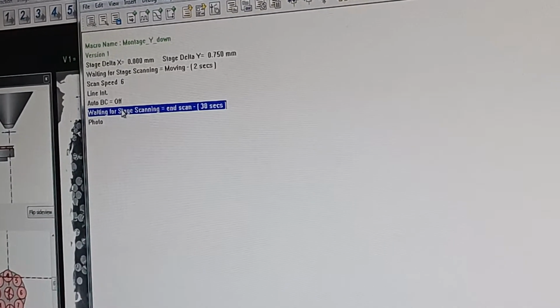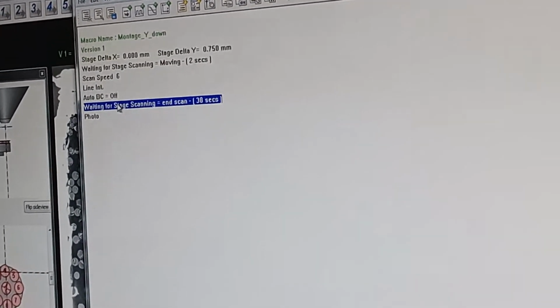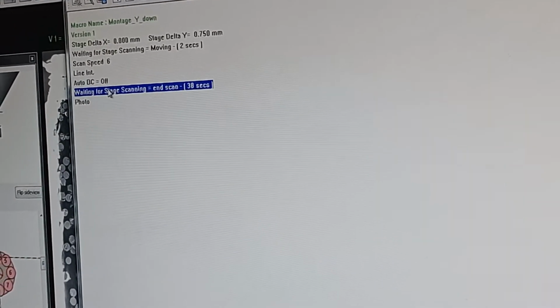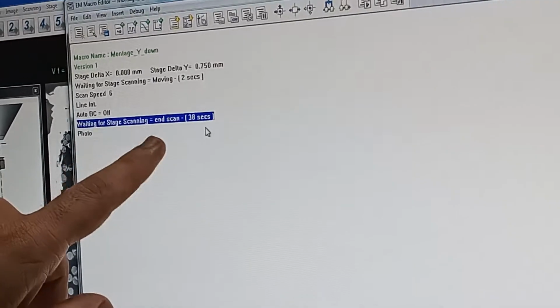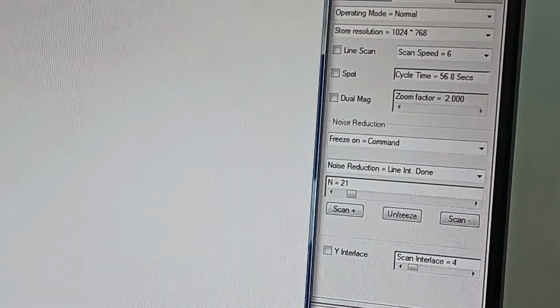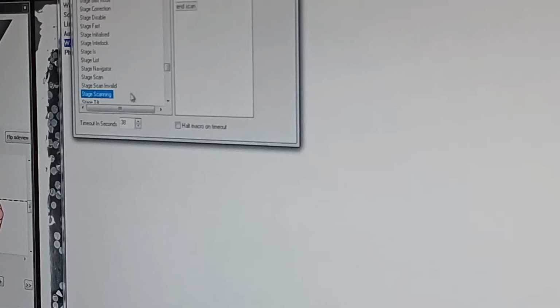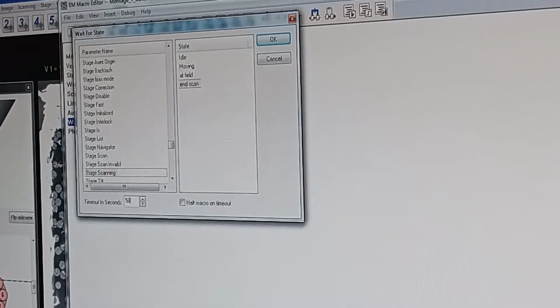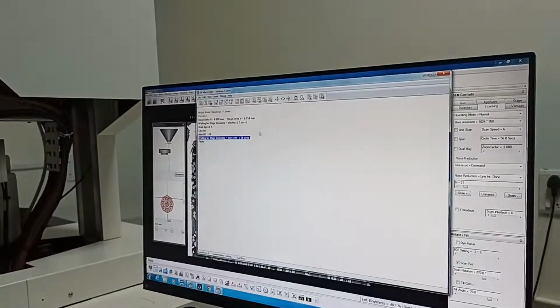That is dangerous and not good. If there is a black feature, then it will try to increase the brightness, so you will have different features. And now this is an important thing: how many seconds you want it to be on. Again you need it to be 58 seconds or so. I'll double click it and enter the value there, 58. So this is done.